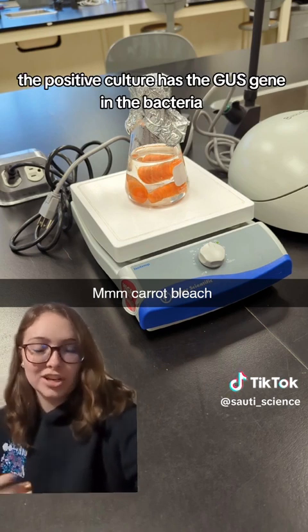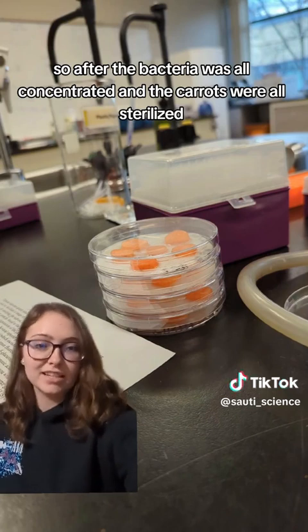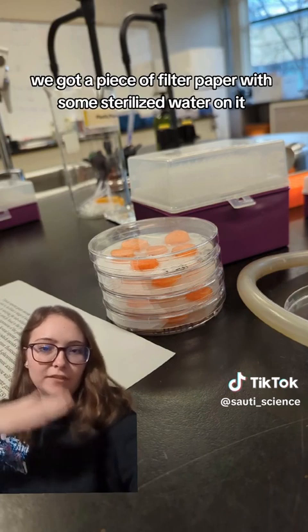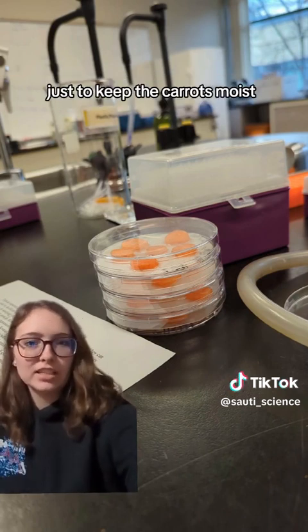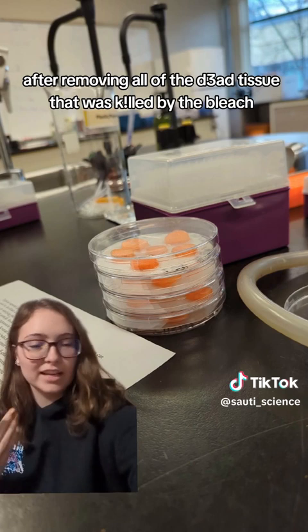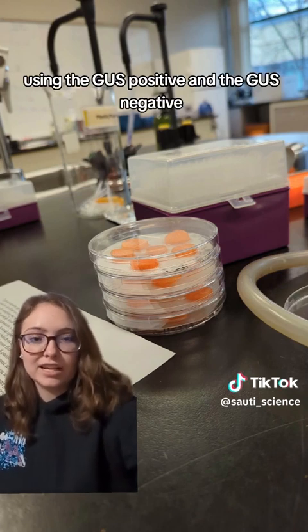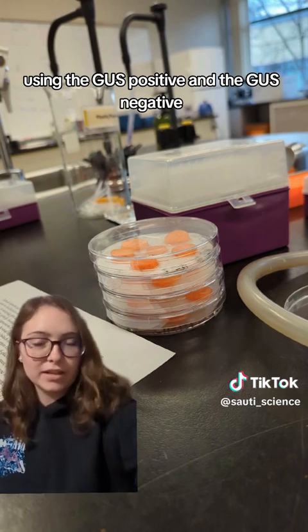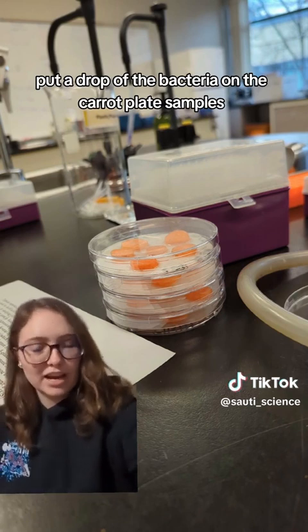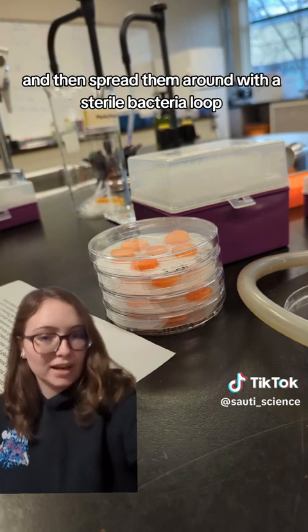The positive culture has the GUS gene in the bacteria while the negative doesn't. After the bacteria were concentrated and the carrots were sterilized, we had to plate them. We got a piece of filter paper with some sterilized water on it just to keep the carrots moist, then put five or six carrot slices in each container after removing dead tissue killed by the bleach. Then we added the bacteria — GUS positive and GUS negative — by pipetting a drop onto the carrot plate samples: two dishes for positive, two for negative, and spread them around with a sterile bacteria loop.